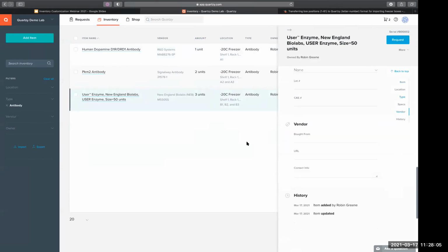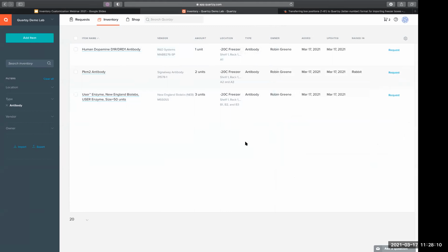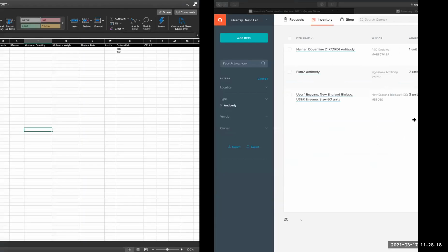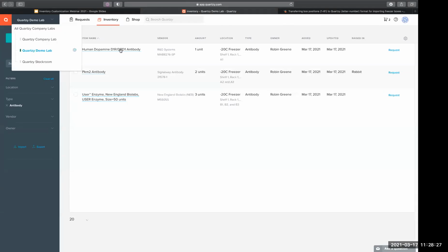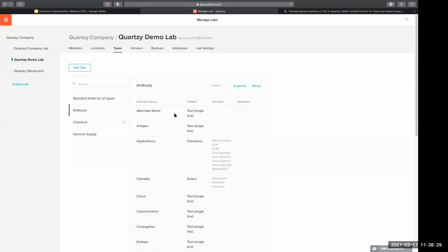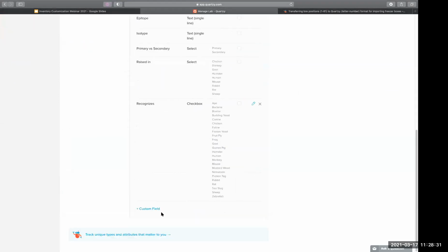And then if you need a place to store where it was actually added for historical inventory, you could definitely add those, like I showed you earlier for the custom fields. That would also be added here if you're uploading in bulk. And we could also do that from here as well. So we could add a custom field from here.